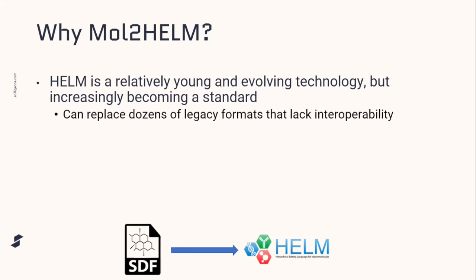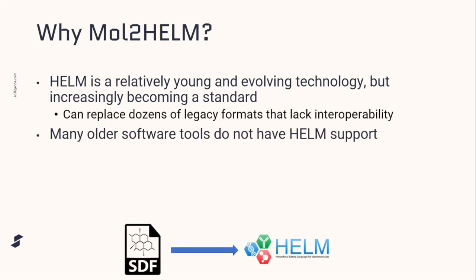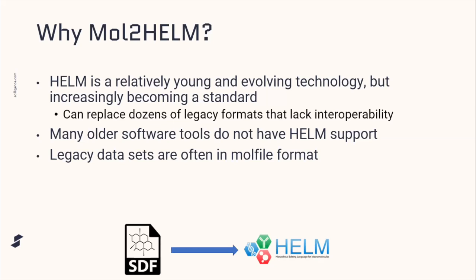So HELM is looking to address that challenge, and we want to help people adopt HELM to address that challenge. A lot of older software tools don't have HELM support, and so a lot of clients may have been working with molfiles or other notations prior to moving to Scilligence RegMol. And so this is a way of helping people get on board with RegMol and HELM. Legacy data sets are also often in molfile format, again, because older software tools often don't have HELM support.